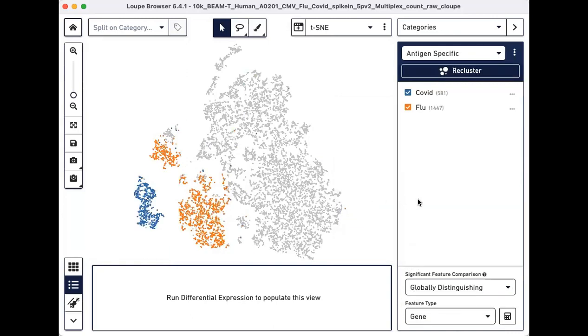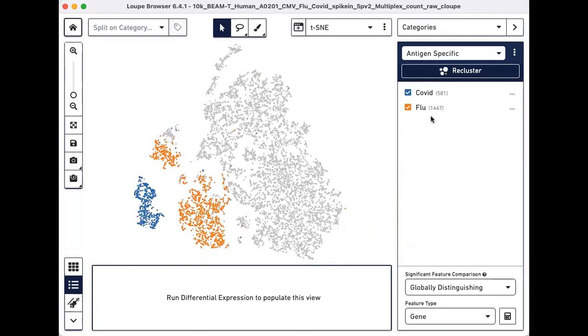Assign again to the Antigen specific category but create a different cluster called flu. At the end of this exercise, the two newly created clusters should be visible on the right panel.